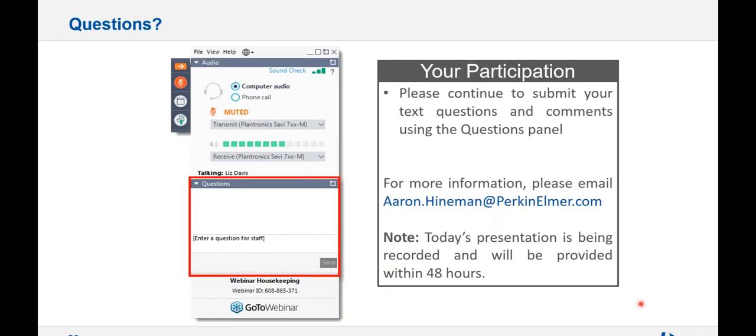Yeah, that's exactly what I would say. Yeah, check alignment. That's usually the first thing I would do as well. But yeah, if there's a lot of TDS, a lot of solids in that material that you're putting into the furnace, you can get a background absorption there as well, and it can be an artifact of overcorrection.